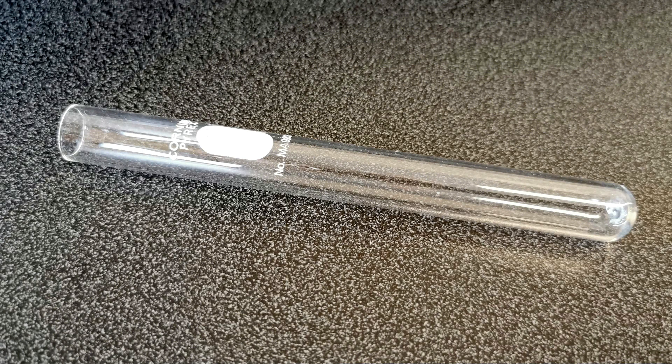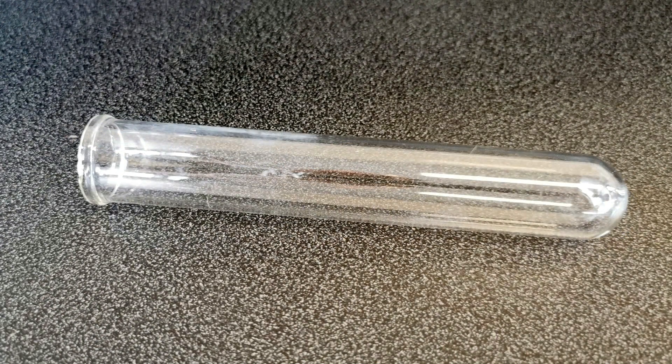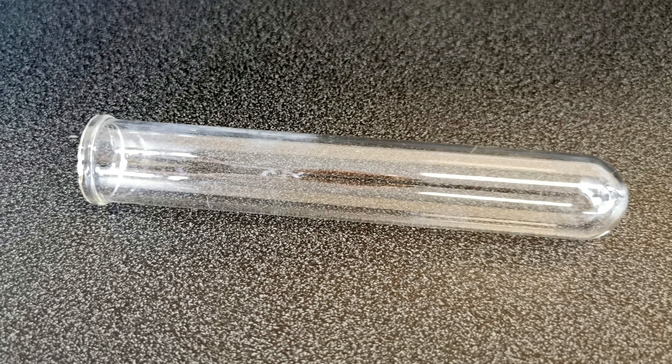Here's another absolutely standard piece of equipment in the science lab — it is of course a test tube. Test tubes come in different sizes; the first one is just a standard one, this one is larger, about two centimeters in diameter, called a large test tube or a boiling tube. If you're going to do boiling, you would generally do it in the larger variety. So there they are — a standard test tube and a boiling tube.